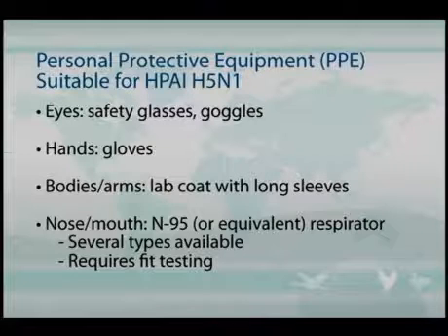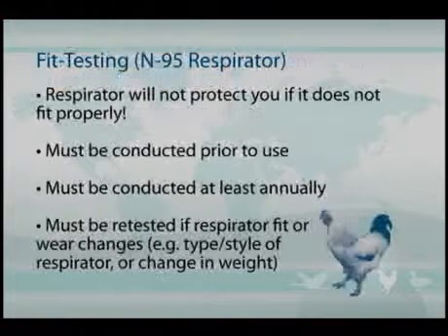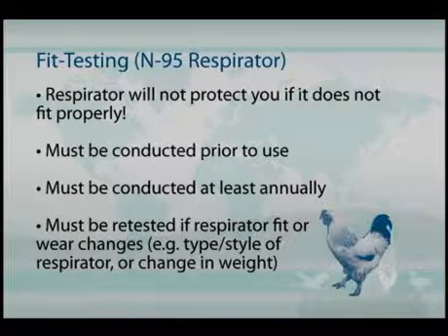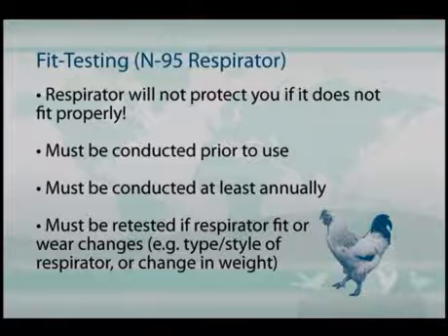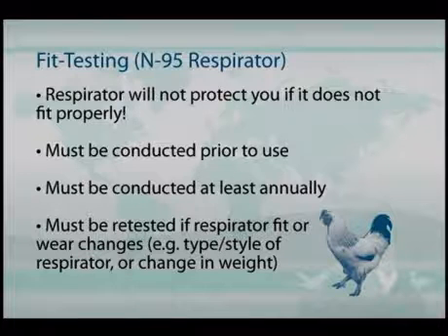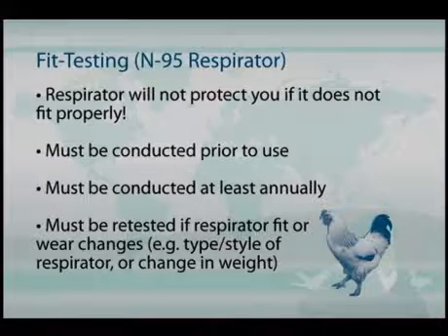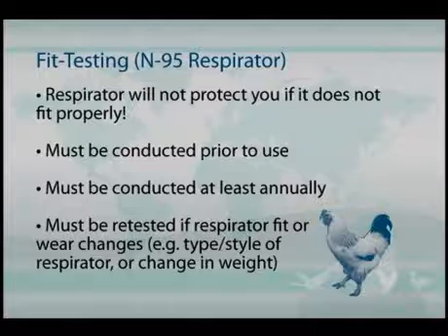But the bottom line is that if you're going to use a respirator, all respirators that are rated N95 or higher require a fit test prior to their use. And this is important, because if you don't have the proper fit of these N95 respirators to your face, it will not protect you. And so you have to make sure that you know how to properly put these on and make sure that they are working as they are designed.